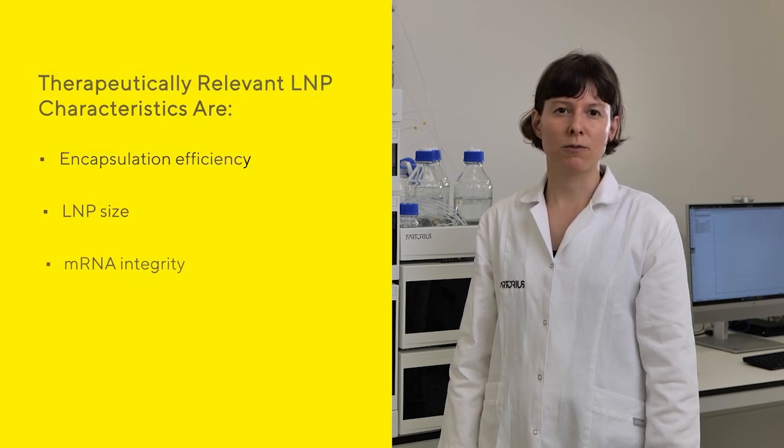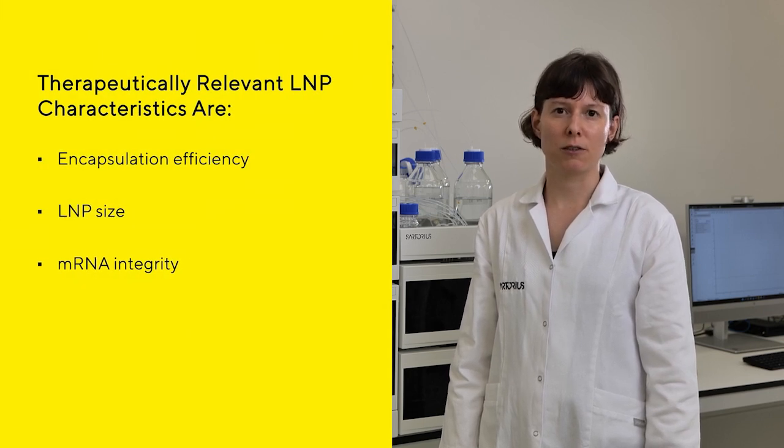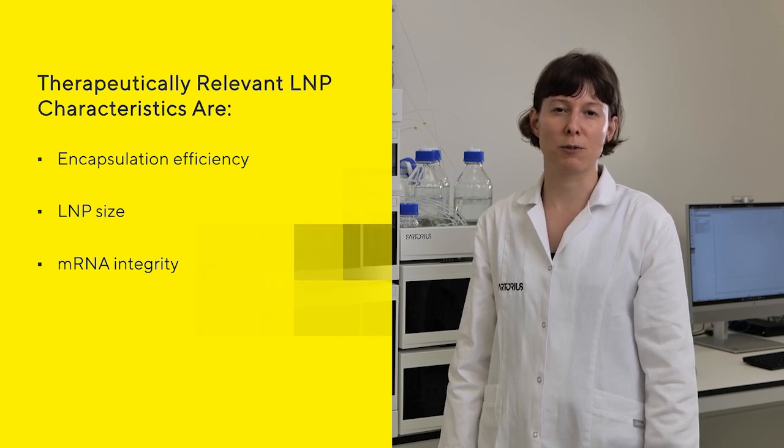As LNP technology advances and its therapeutic use increases, higher regulatory standards are expected, requiring more detailed characterization of LNP composition and stability. Some of the therapeutically relevant LNP characteristics are encapsulation efficiency and LNP size, as well as mRNA integrity.